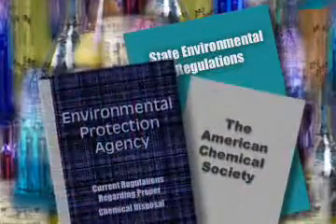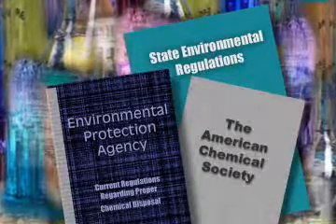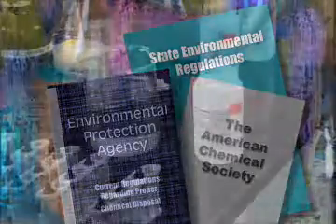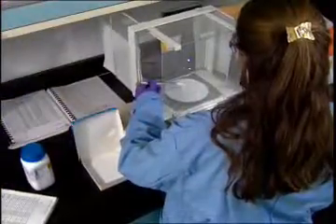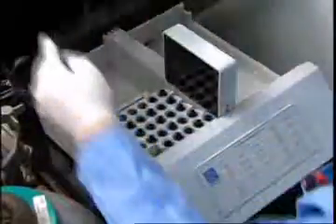The EPA, state environmental agencies, the American Chemical Society, the National Research Council, and others offer excellent manuals on waste minimization opportunities in labs. If in the course of your job you apply your scientific skills and analyze the procedures you perform, you can surely find new, creative ways to minimize hazardous waste in your lab.